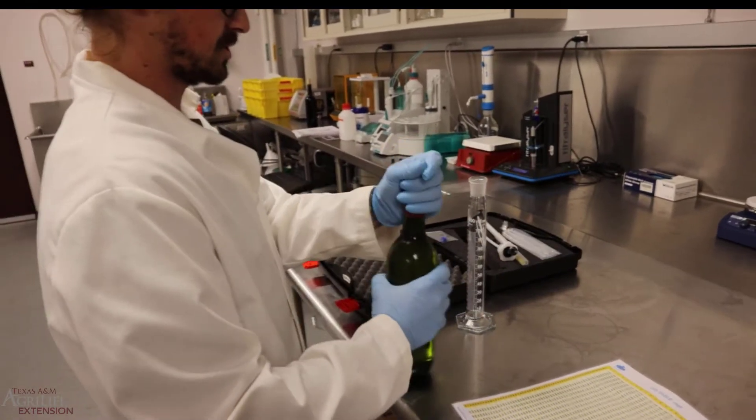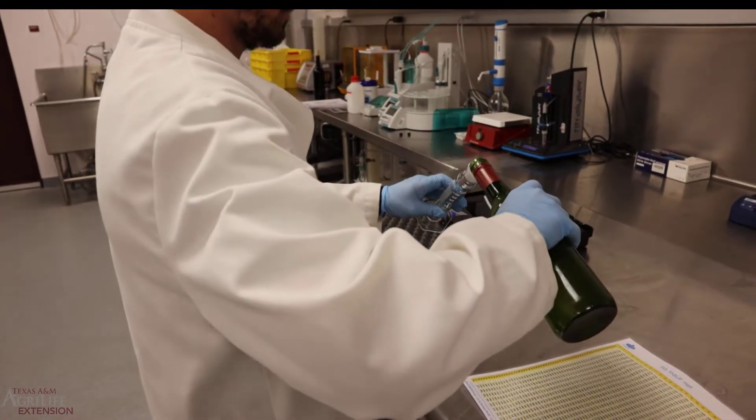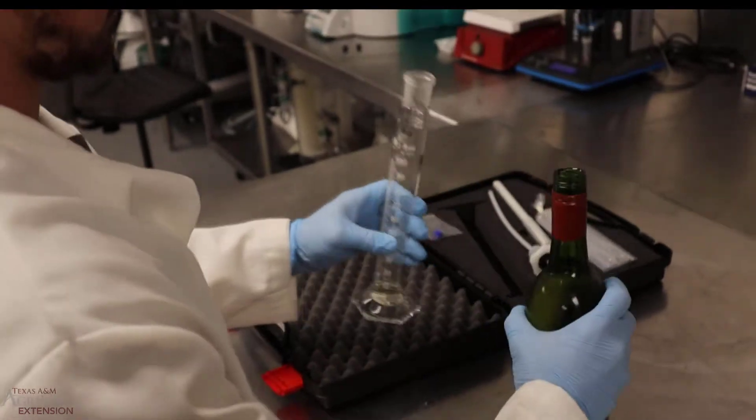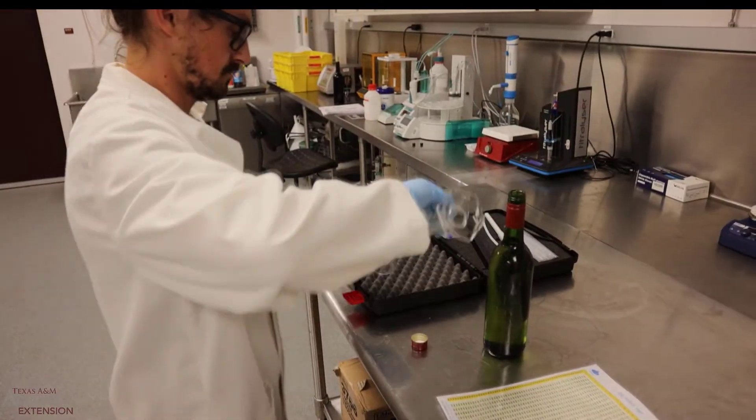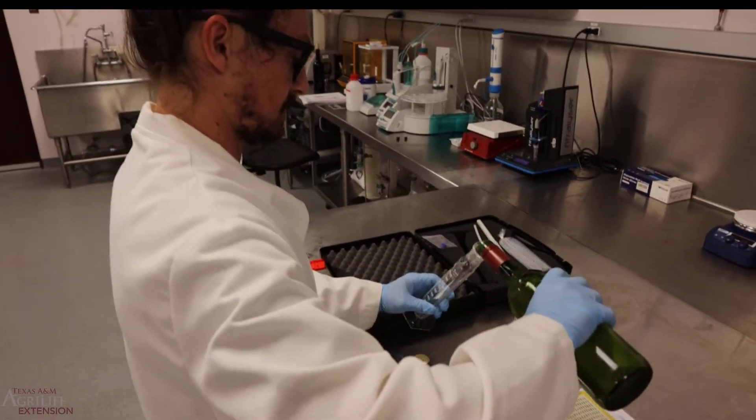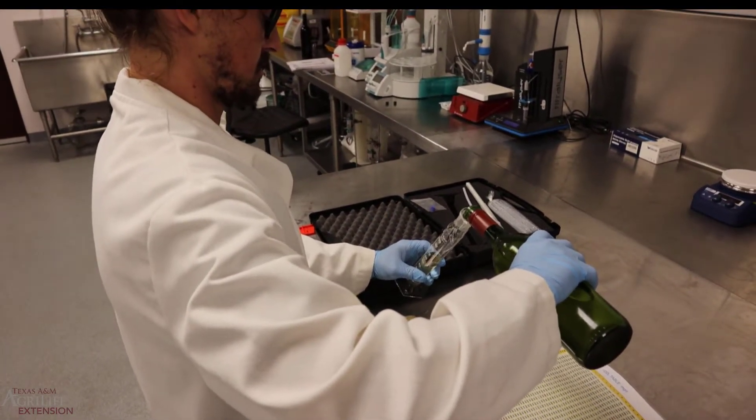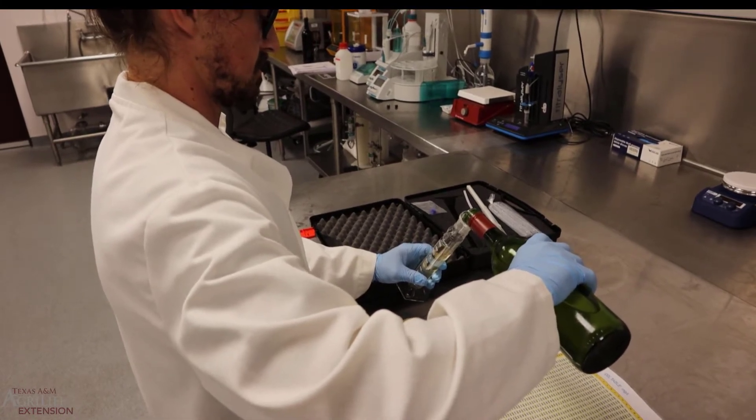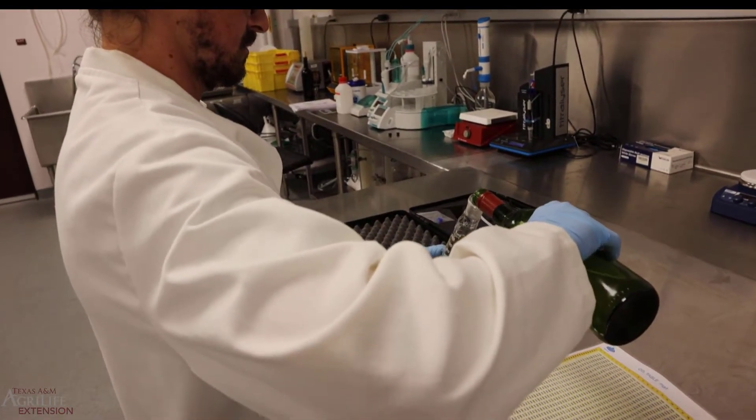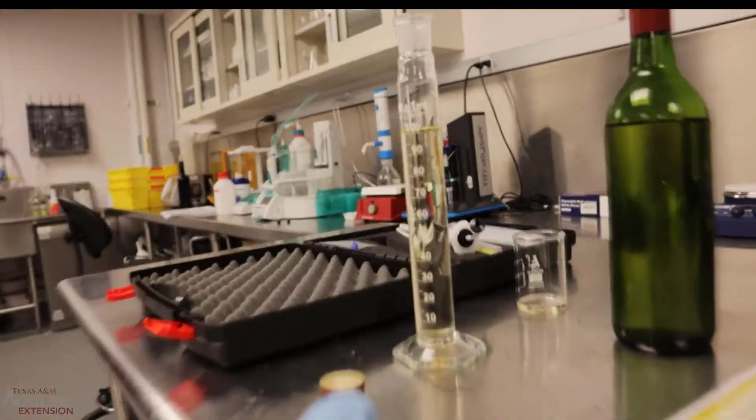Alright, so we'll start out with our chilled sample. We'll gently pour this into the cylinder. We will give our sample a rinse and then once again we'll gently fill this up to the 100 ml mark. If you exceed the 100 ml mark, use a pipette to remove any wine that you need to get out of there.